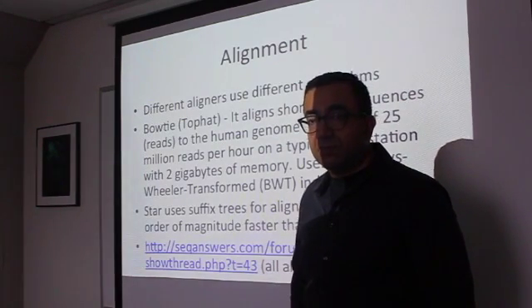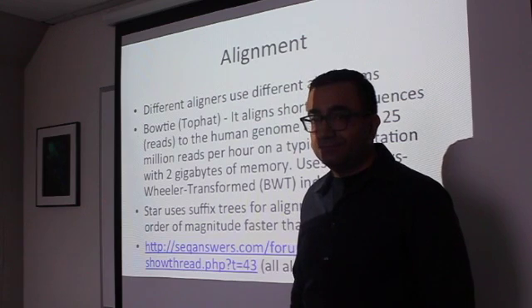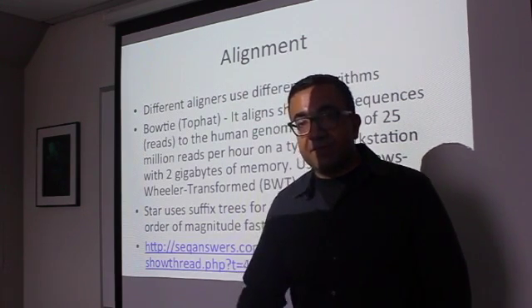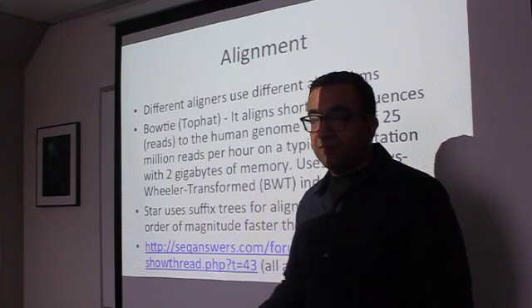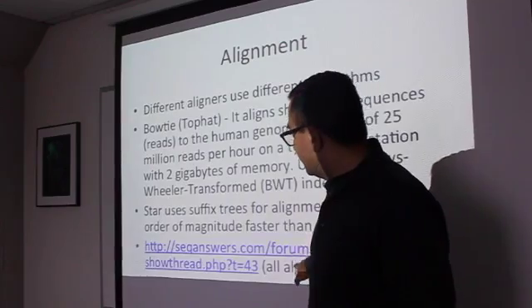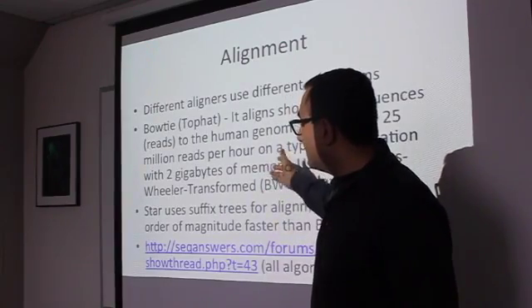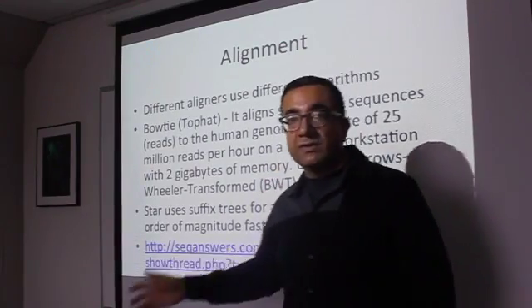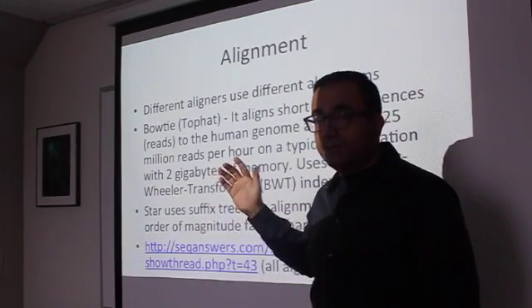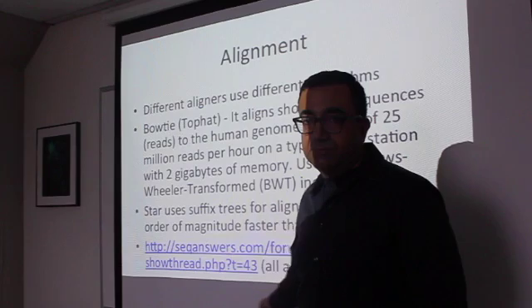So for Eris1, we have... Okay, cool. So we should be using STAR. You can see the advantages and disadvantages depending on your data. If you're looking for a specific kind of splice variants and stuff, Tophat says that they optimize it, but STAR is also very good. They're both really good aligners. It's just for RNA-seq specifically, I prefer STAR.